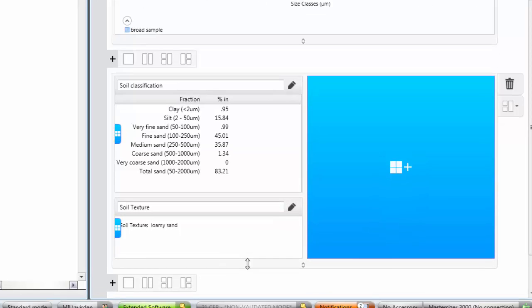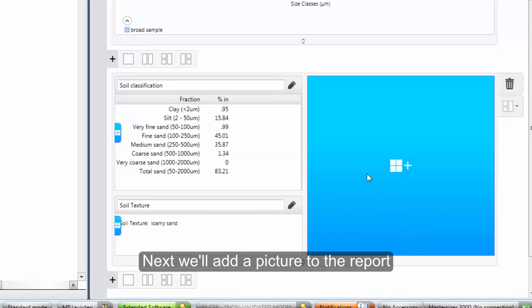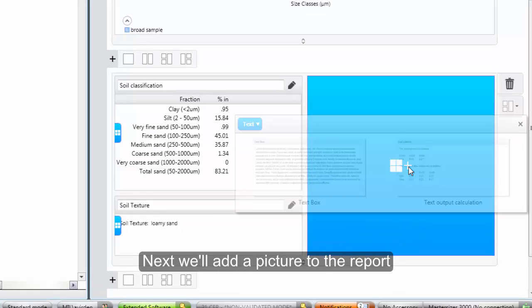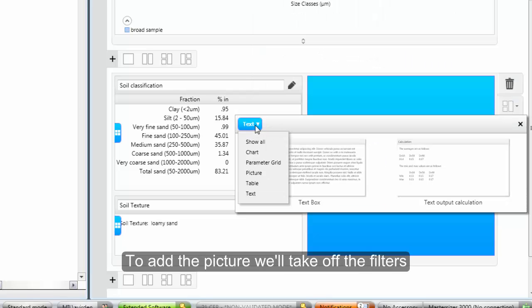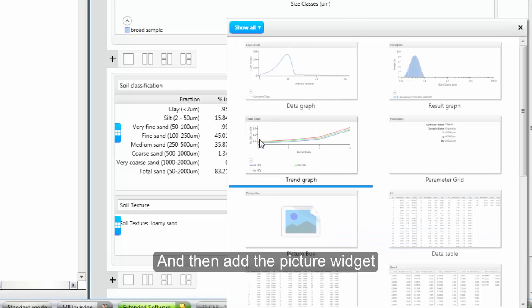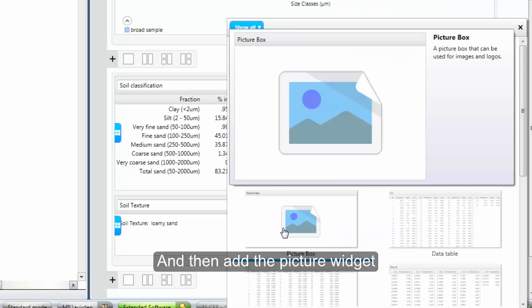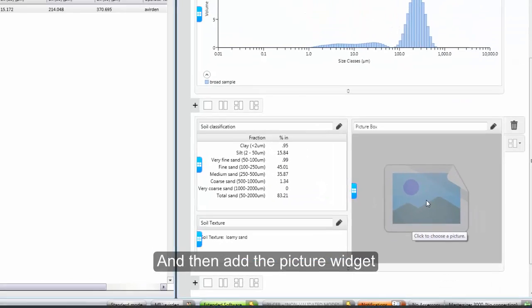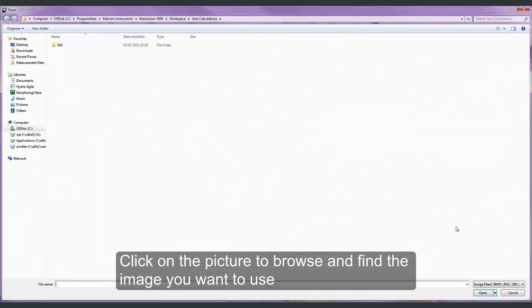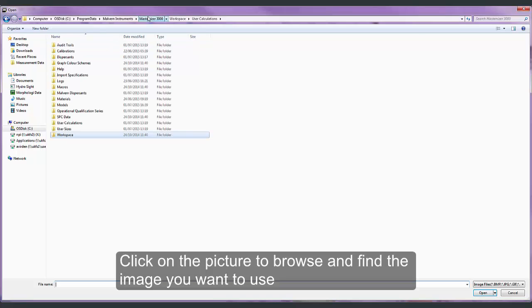And finally in this group I will add a picture. So I am going to remove all of those filters to show all of the widgets. And I can then insert a picture. I can then click on that to browse to the location and add the image that I want.